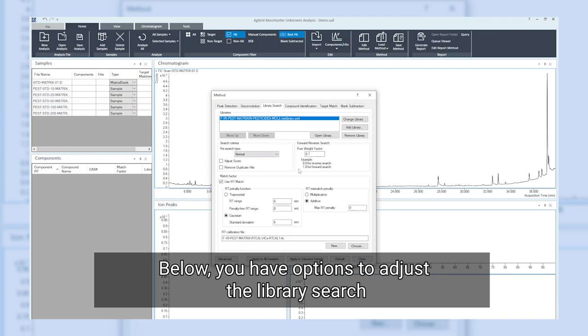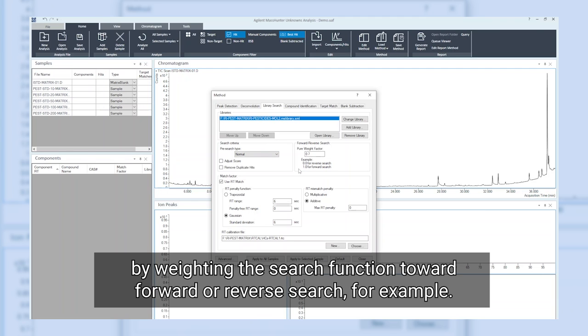Below you have options to adjust the library search by weighting the search function toward forward or reverse search, for example.